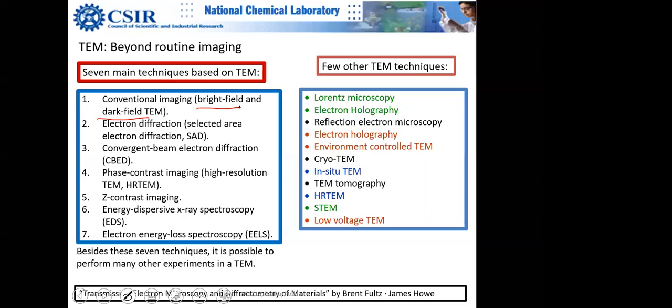So you can select that even if your sample is a mixture of polycrystallites. But remember, a polycrystalline sample means that each grain is still a crystallite. It's a single crystal. In bulk, you can say my sample is not a single crystal; it is a polycrystal. But for electron microscopy, you can select one grain which is a single crystal. So you can do, in principle, single crystal X-ray and single crystal electron diffraction.